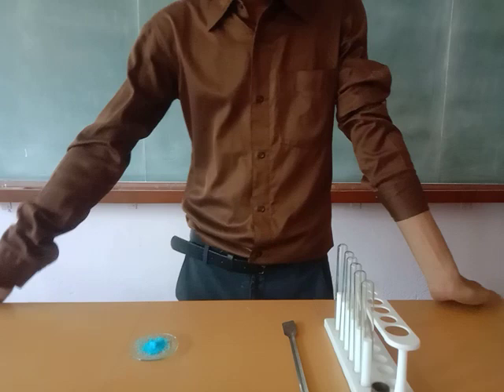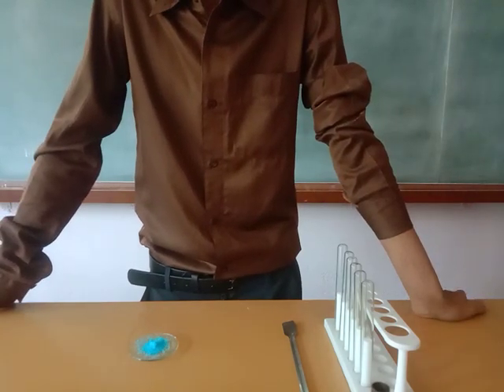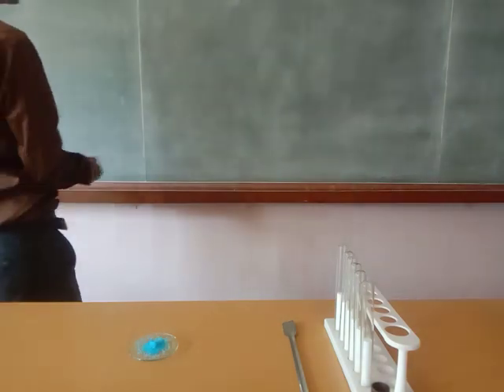Hello everyone. Today I am going to show you this systematic analysis of an unknown salt. First, you write the aim of the experiment.